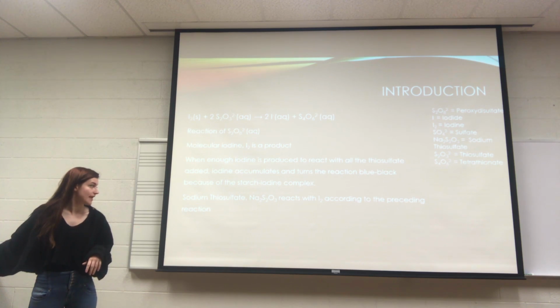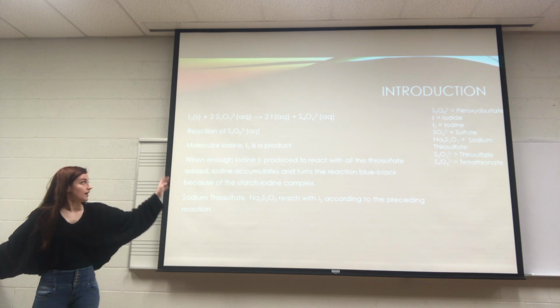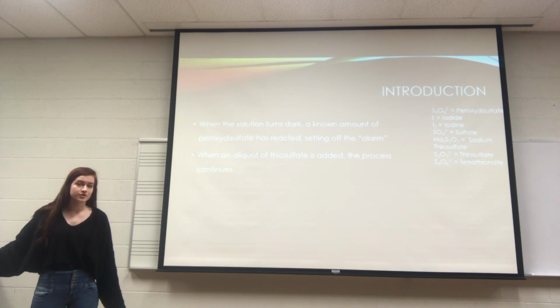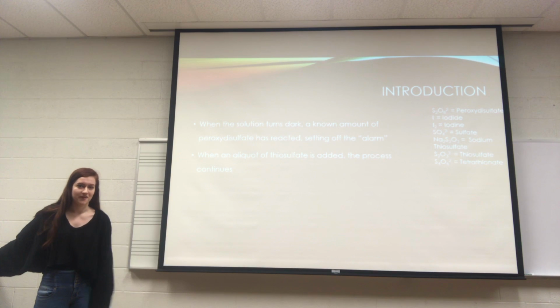Sodium thiosulfate reacts with the iodine according to the reaction up at the top. When the solution turns dark, a known amount of peroxydisulfate has reacted, setting off the alarm, which is why it's called a clock reaction. And when an aliquot of thiosulfate is added, the process continues, and we do that a few times to gather data.